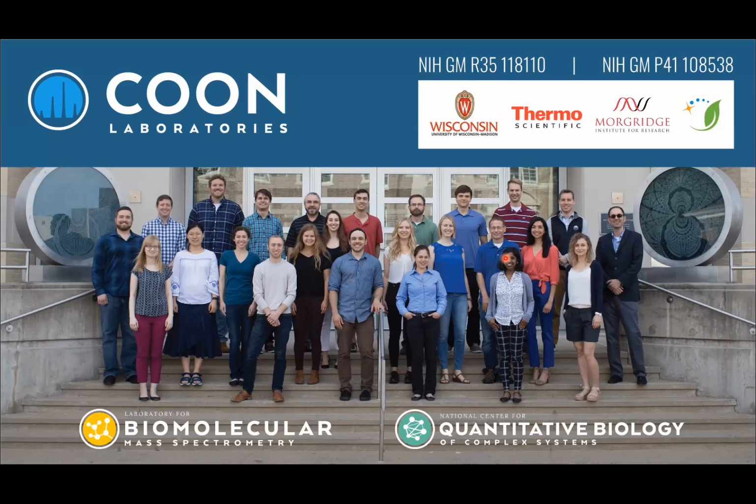Yes, the real-time search that the Thermo team has been developing has also been developed for the metabolites as well, but our team was tasked to help them on the lipid side, but I know that they're working on metabolites too. So many of the same concepts are being applied there. I just don't have those examples because we focused on lipids.